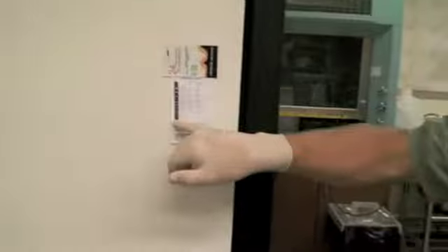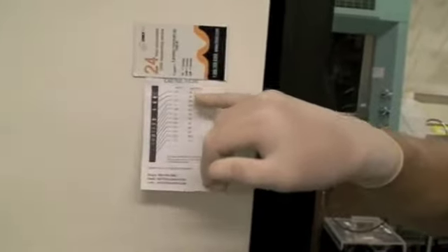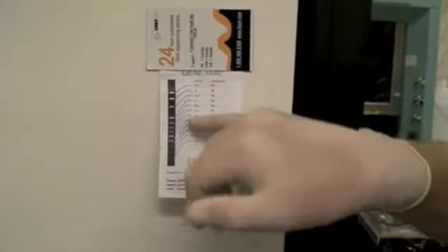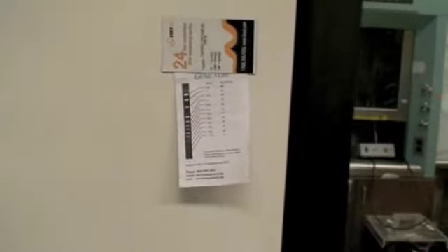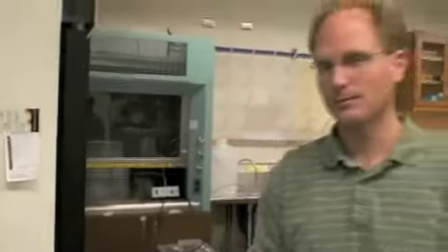And this is the ladder, how it'll appear in the gel. This is the nanograms per band here, and the size. There's a bunch of these in the drawer for the class under the 310 bench.